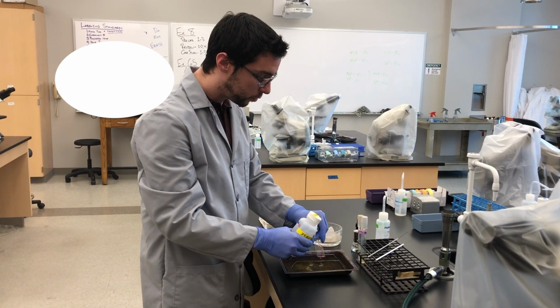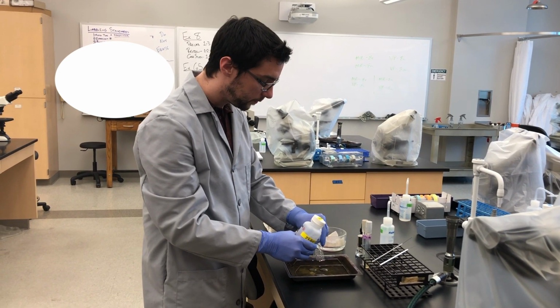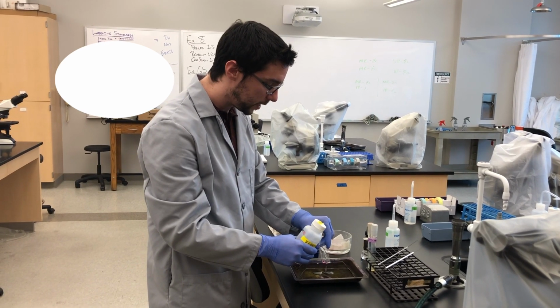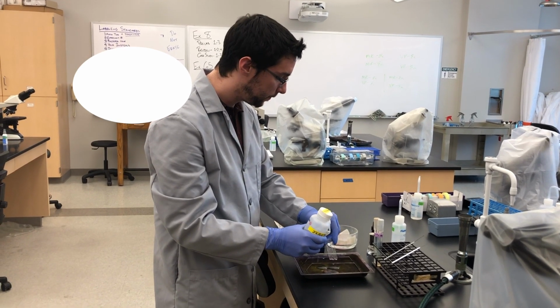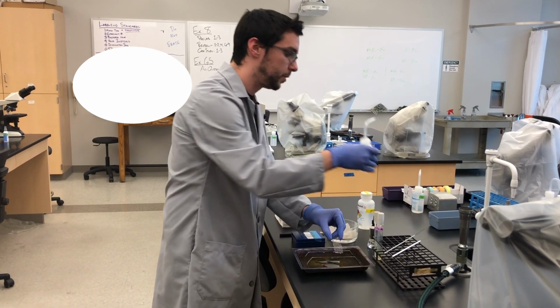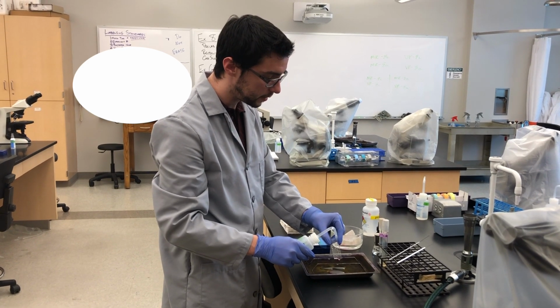If you use your normal ethyl alcohol wash, it's not going to work. And this acid alcohol you do for 8 to 12 seconds, preferring the 12 seconds. There we go. And then immediately follow up with water, again, so we don't over decolorize.